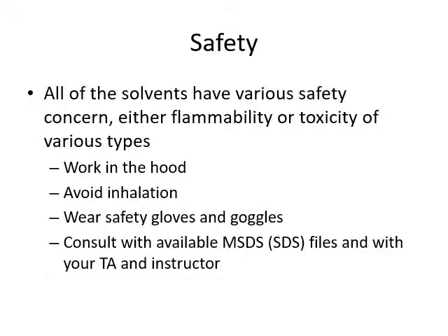If you ever want to work as a chemist or as a scientist working with all kinds of solvents or chemicals, you cannot be afraid of chemical exposure, but you still have to maintain the highest standards of safety. Because all the solvents have various safety concerns, they're either flammable or very toxic. You always have to be working in the fume hood. You have to avoid inhalation.